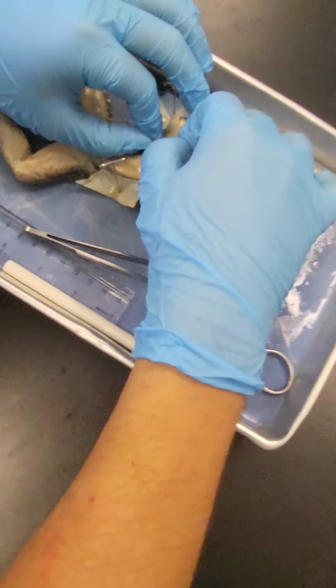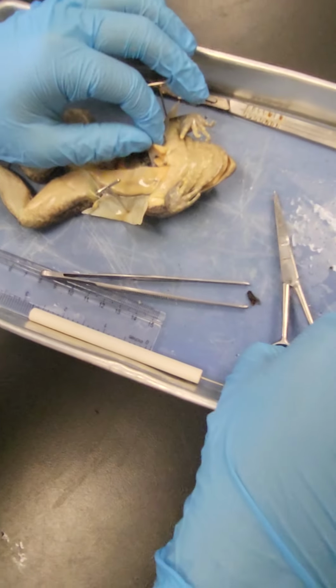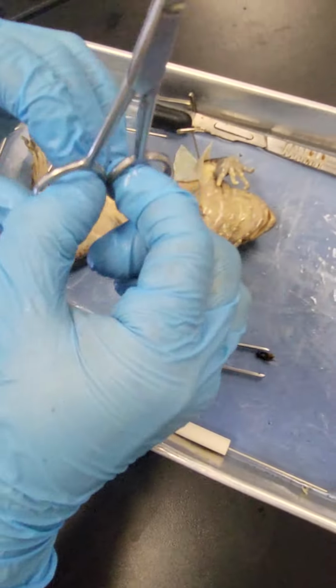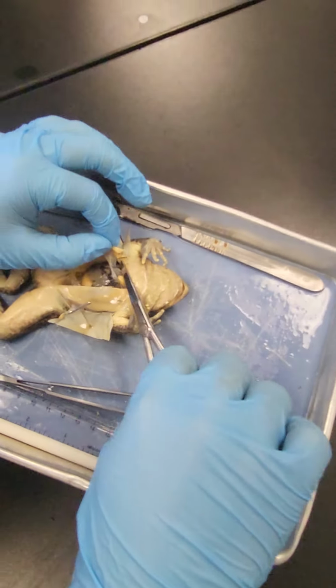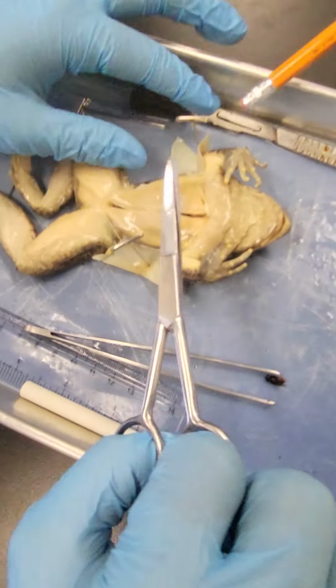What is it, Ollie? It better not be something nasty. Did you cut its rib? Yes. Oh my God. He cut the rib. You have to eventually. It's just he did it really early. We're still early into this. The syringe to collect frog juices. Hey, Ollie, you can cut the skin off.